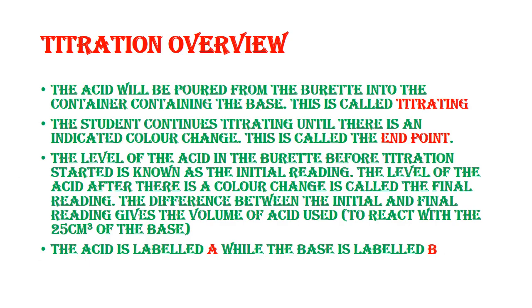Still on the titration overview, the acid will then be poured from the burette into the container containing the base. The essence of explaining all this is for you to know what you are supposed to do, because you wouldn't know how to manipulate when you don't know what to do. That is the essence of all these explanations I'm giving you first, for those of you who don't know, and for those of you who know, to ascertain what you have to do.